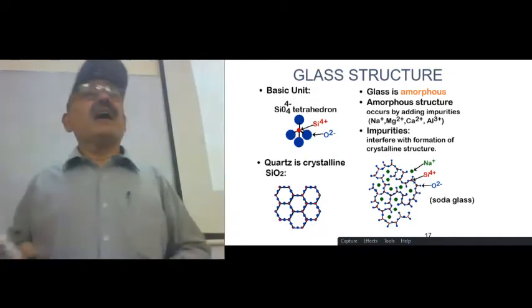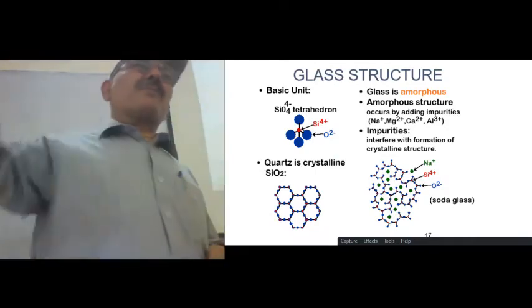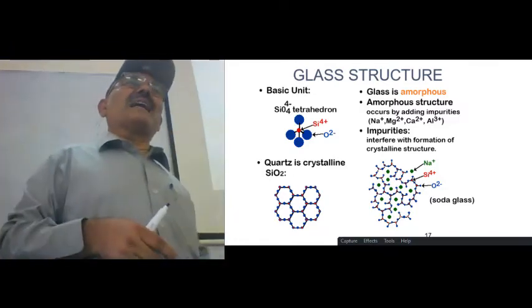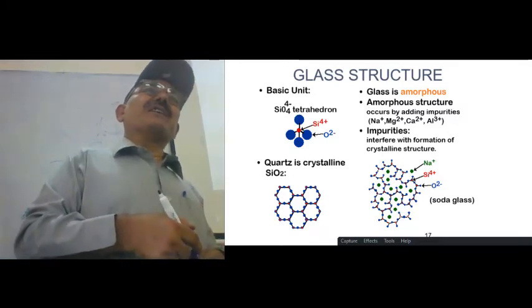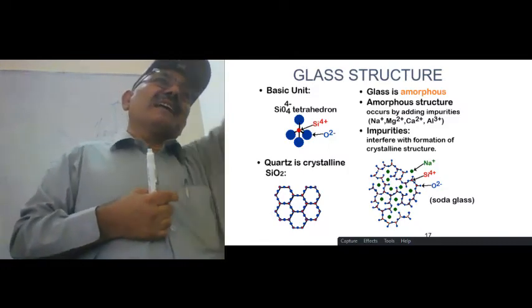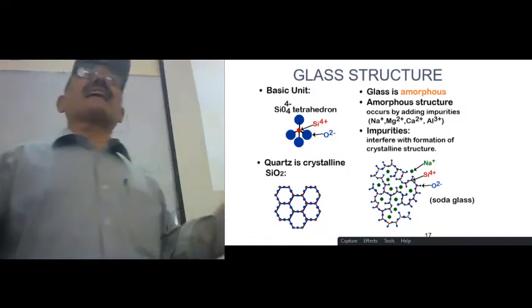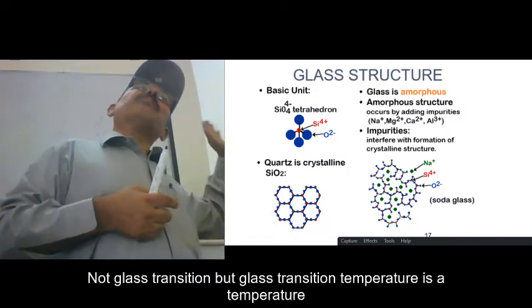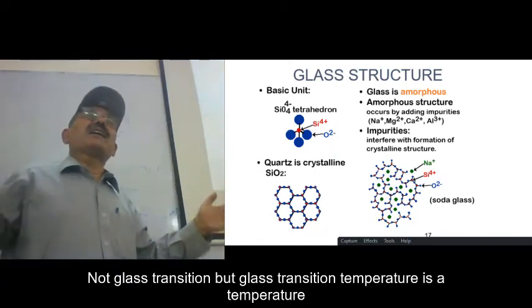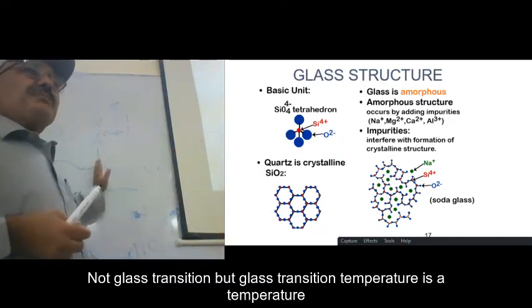But as a scientist, I told you that the whole world of science is moving around the transformation of phases and the reaction of materials with other materials. And when you come to the electrical properties, the electronic properties, you are playing with the small atom with the nucleus in the center and the electronic cloud in the case of metals and the electronic orbits in the case of non-metals. And that behavior of the electron is governing the whole principles and the whole ways of technology in the modern world.